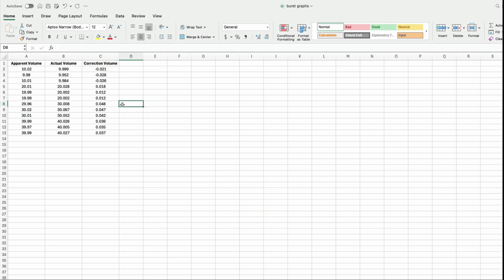Now, you'll notice that unlike the tables that you have set up in your book, where you have these broken down into different sections, these are all presented in one mass. I usually suggest this. Here it would be extremely helpful if you could identify somehow which sets of data go together.